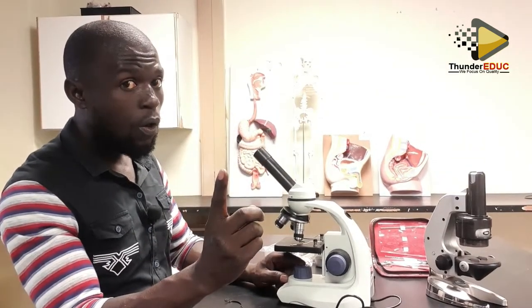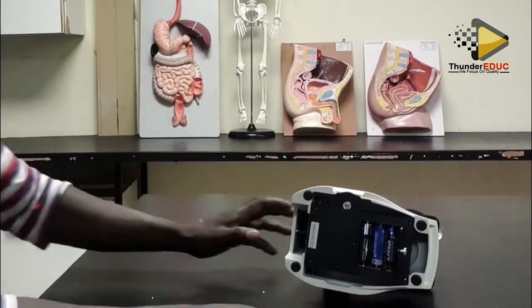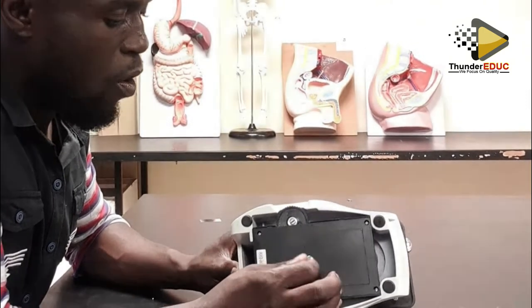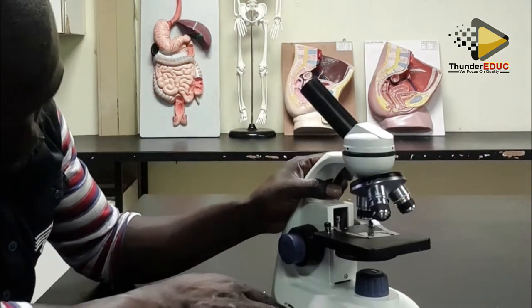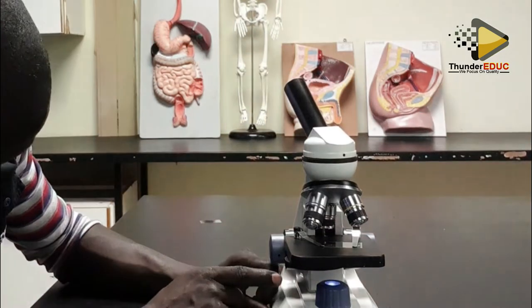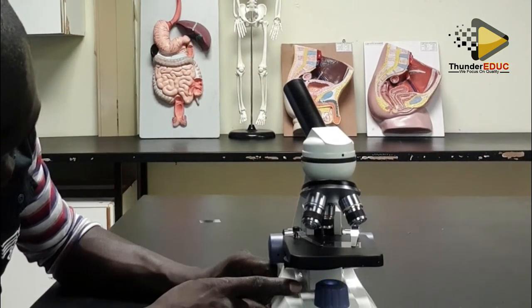Or you bring the bulbs. Now when you put in the batteries, you close it, you put it here, and then you switch it on. You see, now the light is coming. But this light, I can increase or I can reduce. You see, it is reducing, it is increasing. You see, it's reducing, it's increasing.